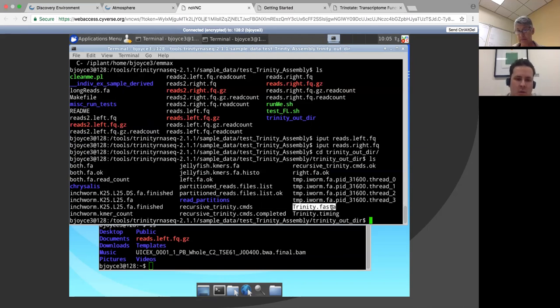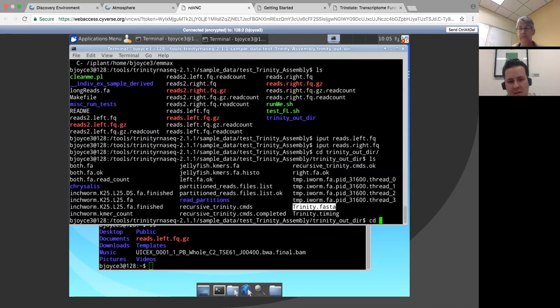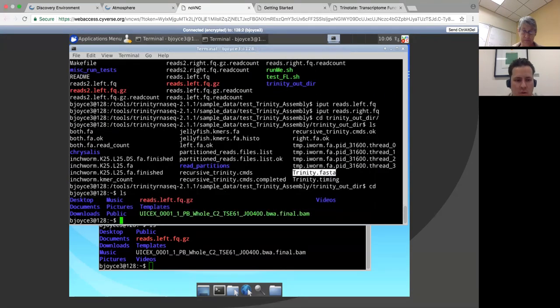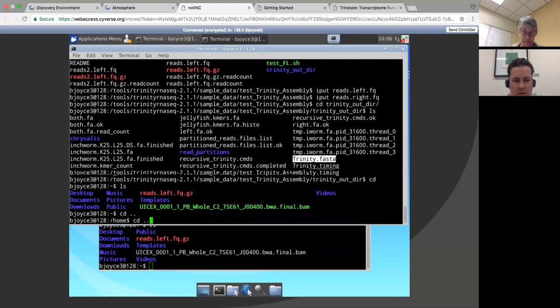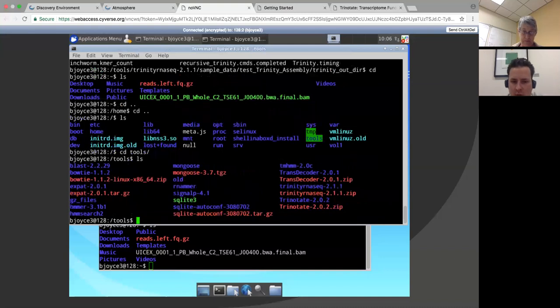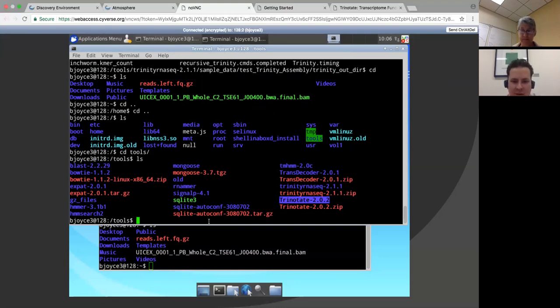We're going to switch from doing the assembly to doing the annotation with Trinotate. For the sake of time, I'll walk you through a few of the setup pieces of Trinotate and show you how to run the very first bit. Trinotate is actually not a single tool — it is many tools put together to create a very large meta-tool. This is version 2; there is a version 3 available and we're starting to deploy that. Documentation associated with this will also be updated inside the wiki referencing the new Trinotate GitHub manual.